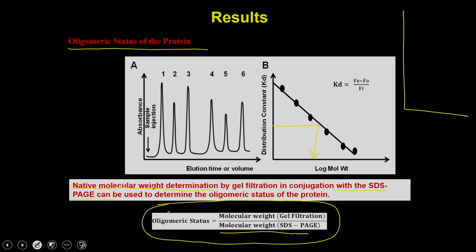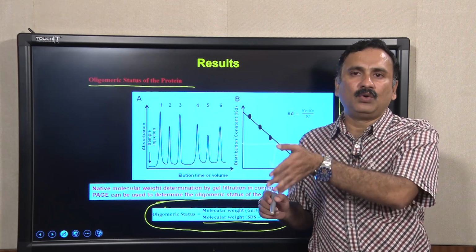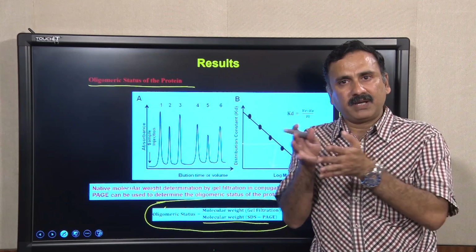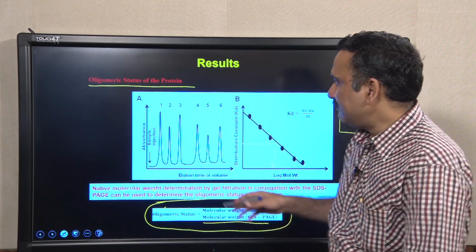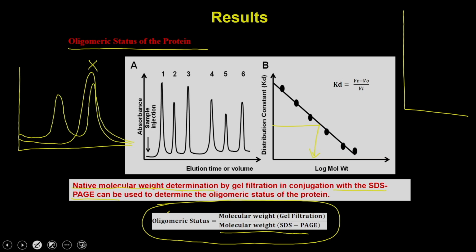Apart from that, quality testing can also be done when you analyze protein X on the gel filtration column. What you get is the pattern of protein X in that particular buffer condition. You can imagine that protein X either gives you a single peak, or in different conditions protein X might give you 2 peaks.